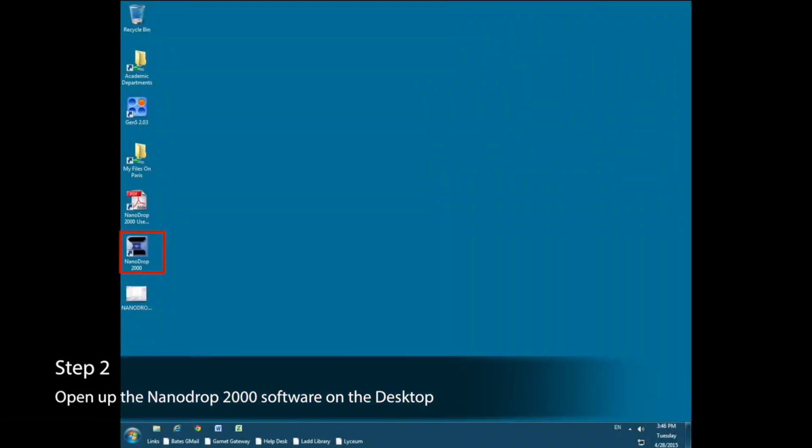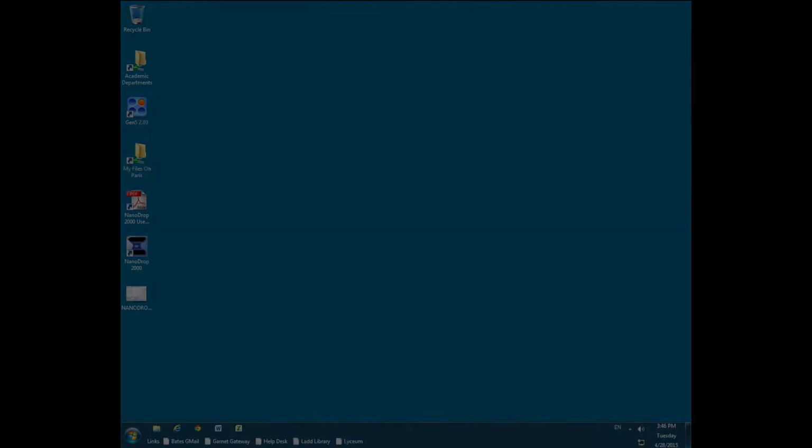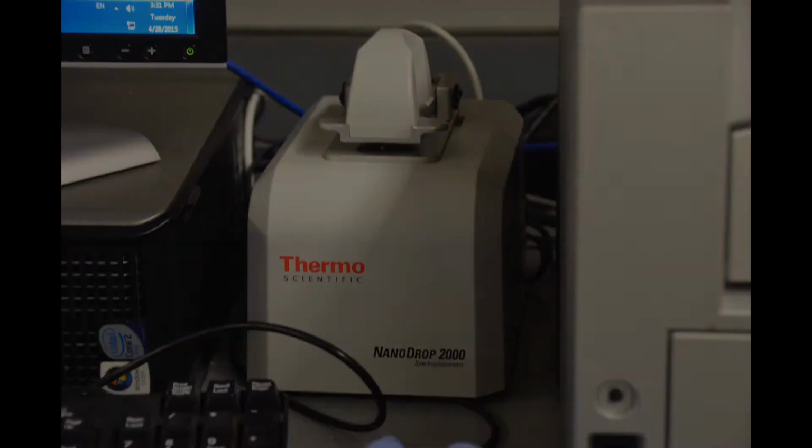Log on to the computer adjacent to the nanodrop and open up the nanodrop software. Assuming you are using the nanodrop after RNA extraction, choose nucleic acid when prompted to choose the type of sample you are working with. You must now calibrate the nanodrop. Make sure that the sampling arm is down when the calibration is performed.